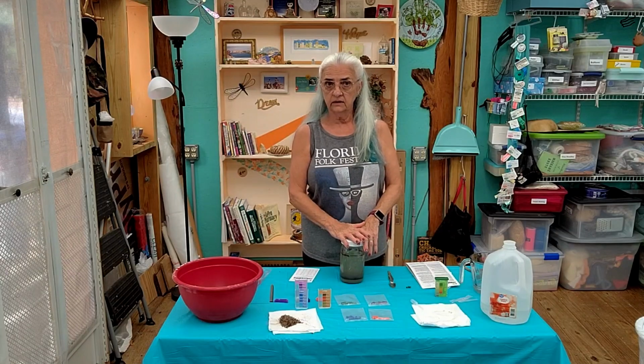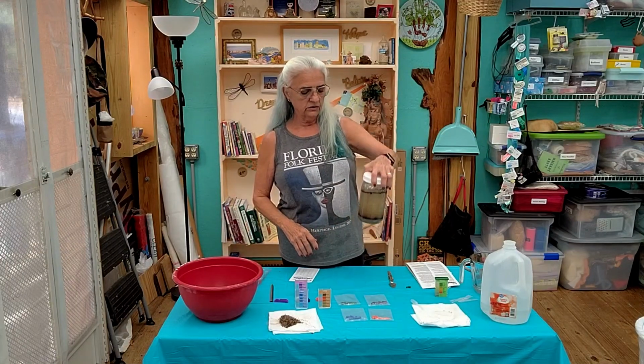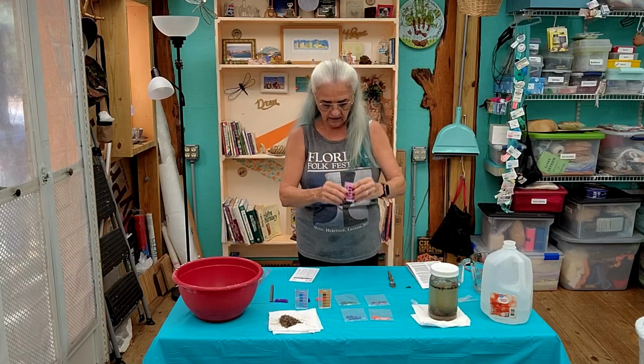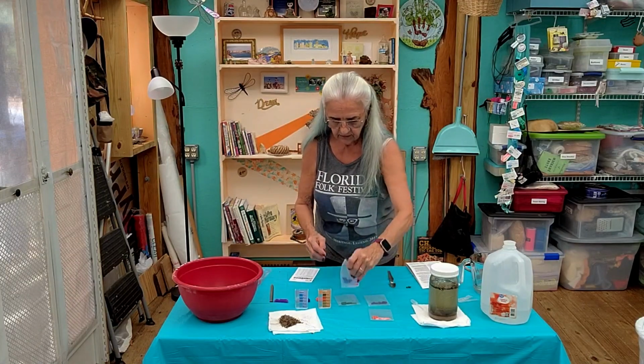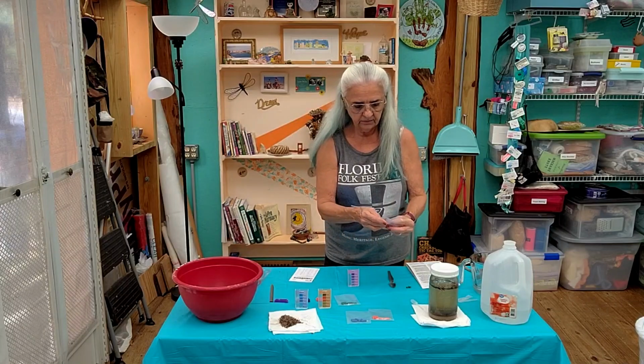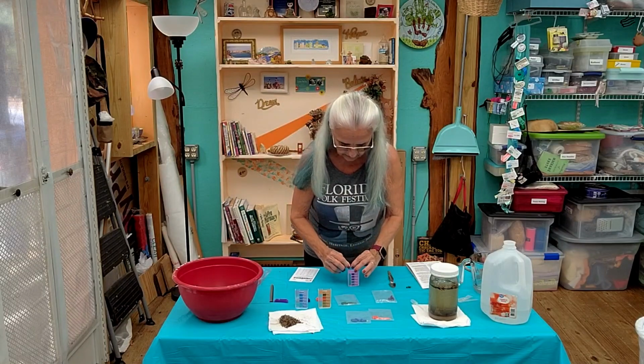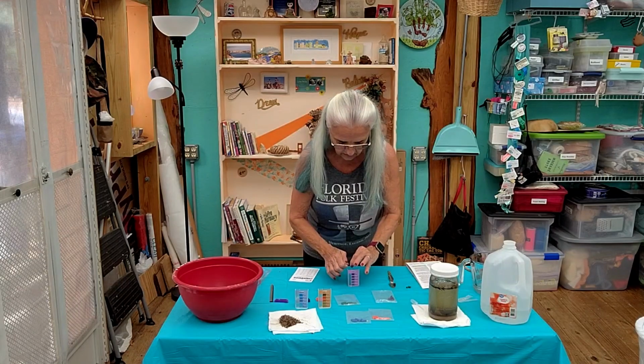It tells you to shake it up real good and then let it sit. It says 30 minutes to 24 hours, and for me, it was easy enough to leave it for 24 hours. So then I get this kind of a division in there, and it says the clearer the better, but the cloudiness will not really affect the test. So I've gone ahead and put the dropper full up to the line, and for this one, it's the purple. We want to put the purple in the purple container, and I'll try to do what I can, see if I can not spill it everywhere or knock over the water.